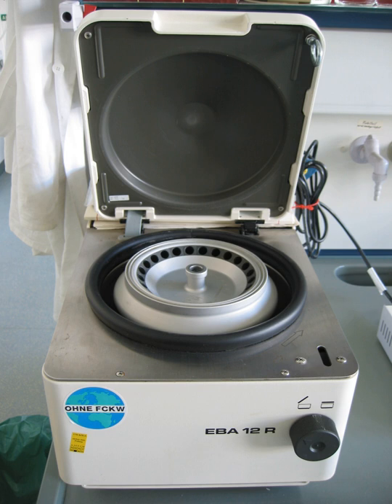Because of the heat generated by air friction, even in ultracentrifuges, where the rotor operates in a good vacuum, and the frequent necessity of maintaining samples at a given temperature, many types of laboratory centrifuges are refrigerated and temperature regulated. There are different providers of laboratory centrifuges like Meditech, Eppendorf, Thermo Heraeus, Thermo Sorvall, Hettich, Beckman Coulter, MSE, Sigma, Remi and AWEL International.